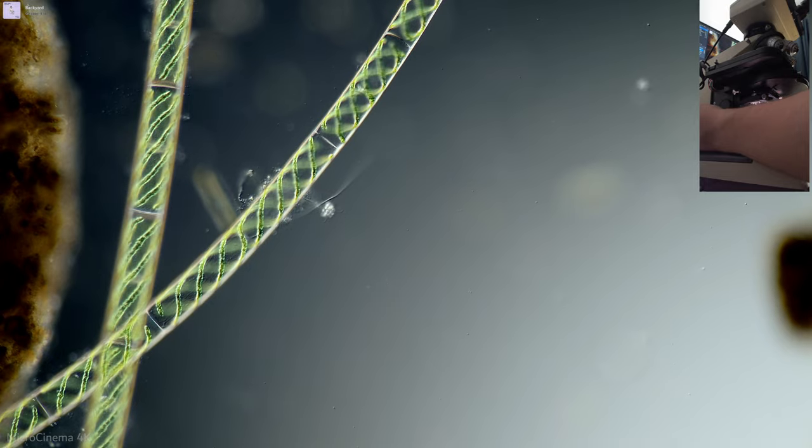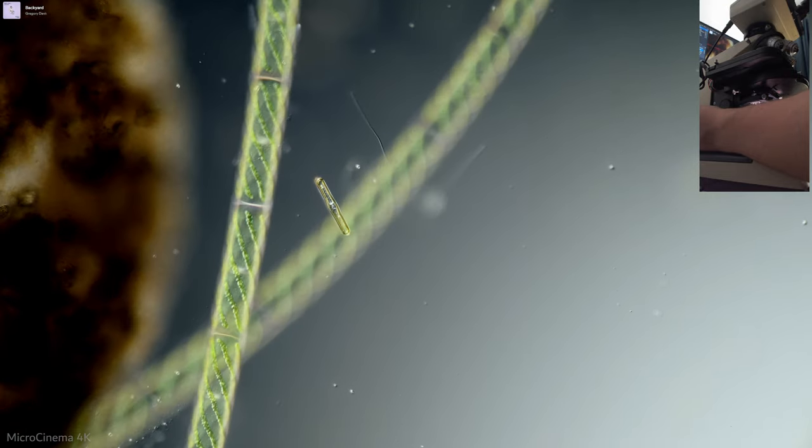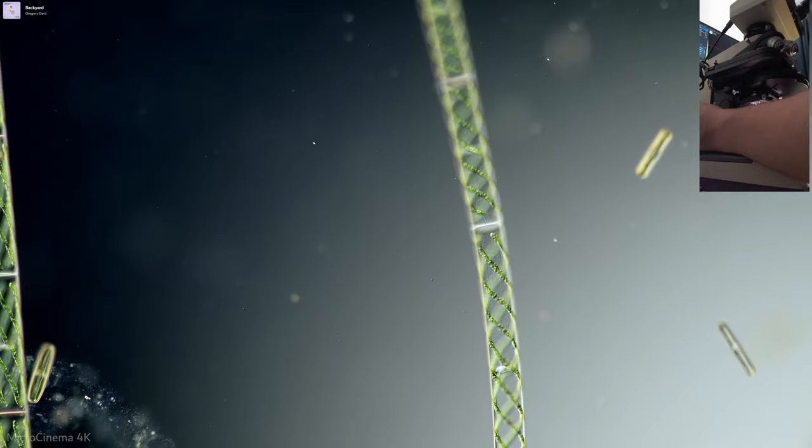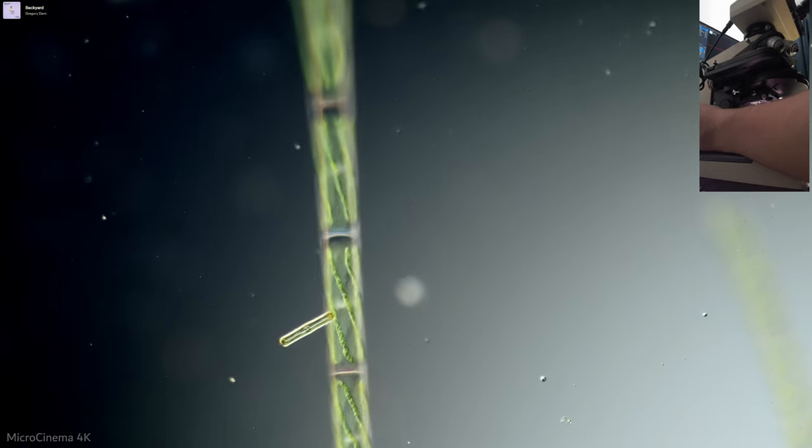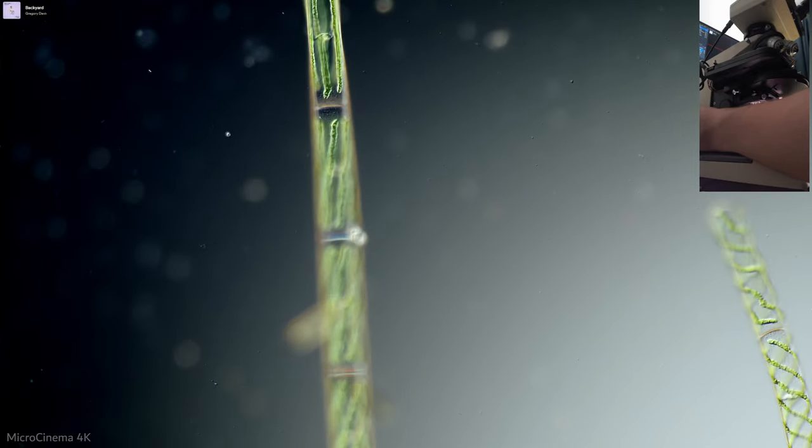Oh, look at that. Oh, I forgot what these are called. I just talked about them the other day with another streamer and yeah, just super beautiful. This area.